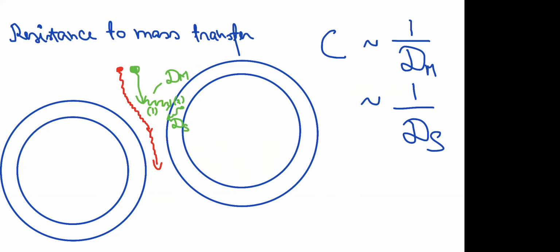in the longitudinal diffusion, we had a case where we wanted the mobile phase to be quite viscous to avoid longitudinal diffusion. Then here, from the resistance to mass transfer point of view, we would actually like the mobile phase to have a very low viscosity to make the transfer of the molecule from the mobile phase to the stationary phase as efficient as possible.